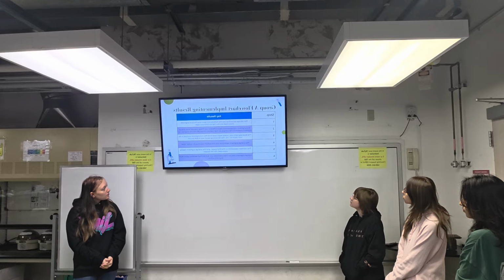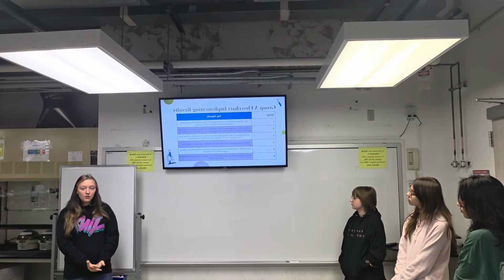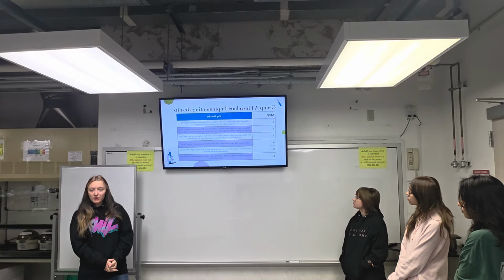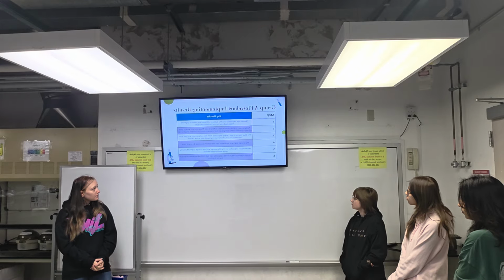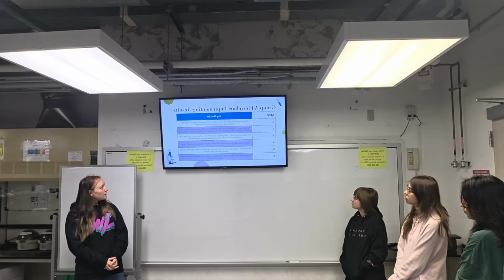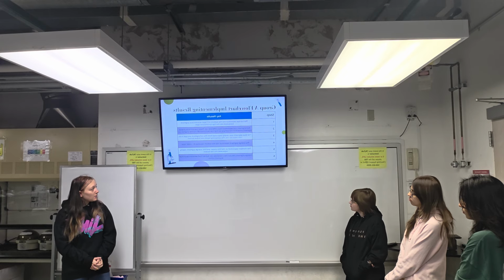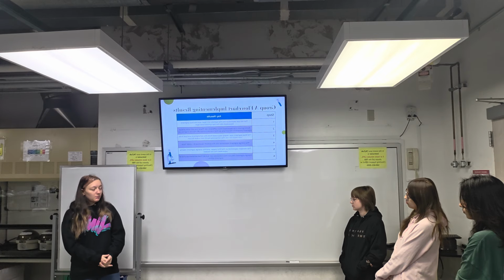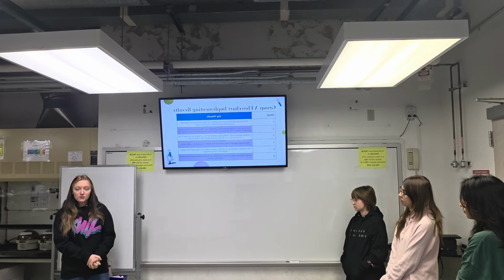Step 4, we had the orange pigment separated into the bottom aqueous layer and the DI water. Minimal issues there. In the Hirsch filtration, we had the mordant separated on the filter paper, and the orange pigment was cleanly separated into the beaker. Our 6th step, the orange pigment we did put into a separate vial, but it still had some semblance of blue pigment with it.